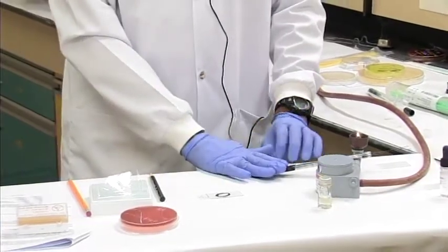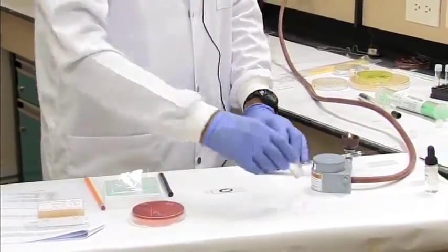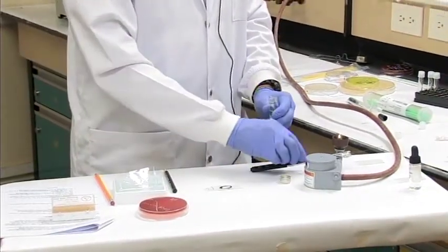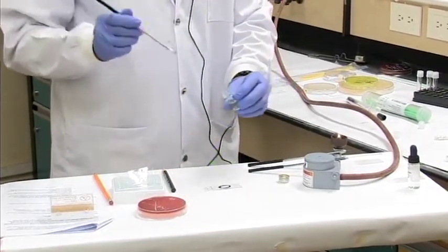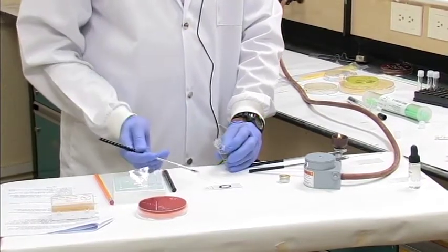So we have our loops that are flamed and cooled. We're going to add a drop of either water or saline onto our microscope slide. After 5 seconds, 10 seconds, the loops are cooled. So here we're going to take a drop of our saline and place it on our slide.